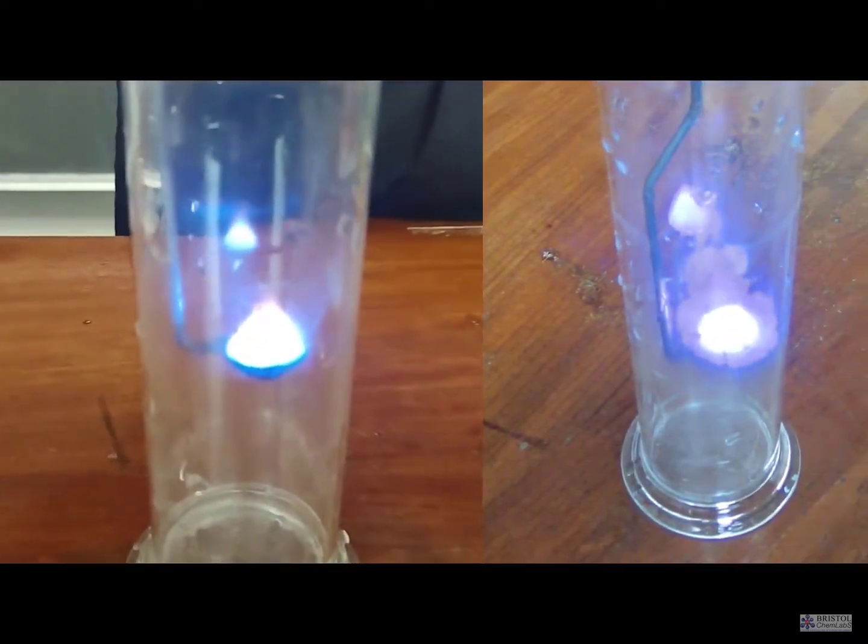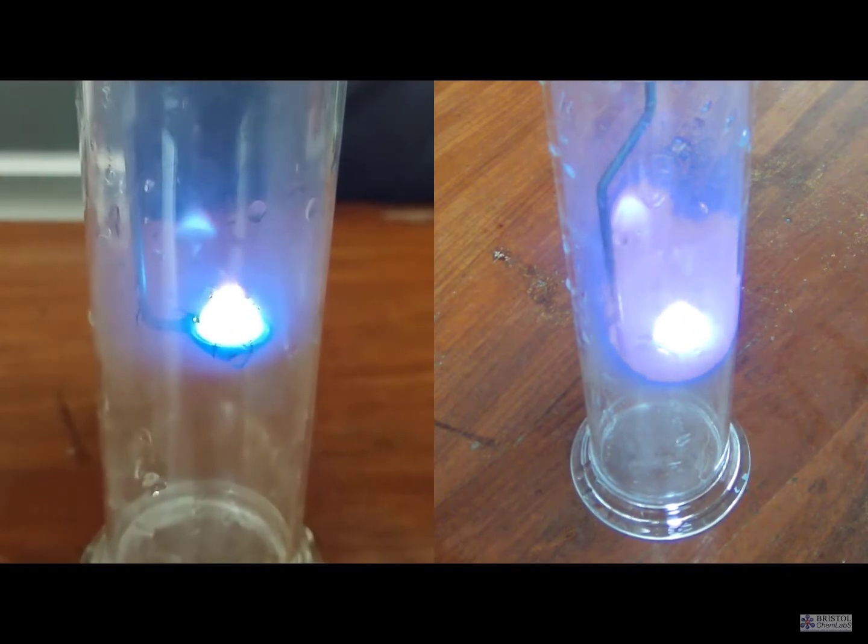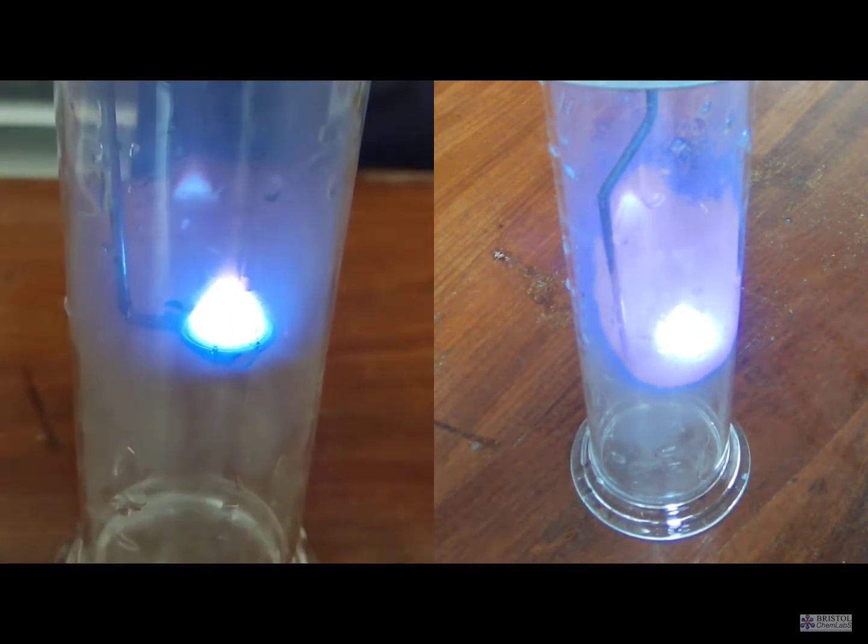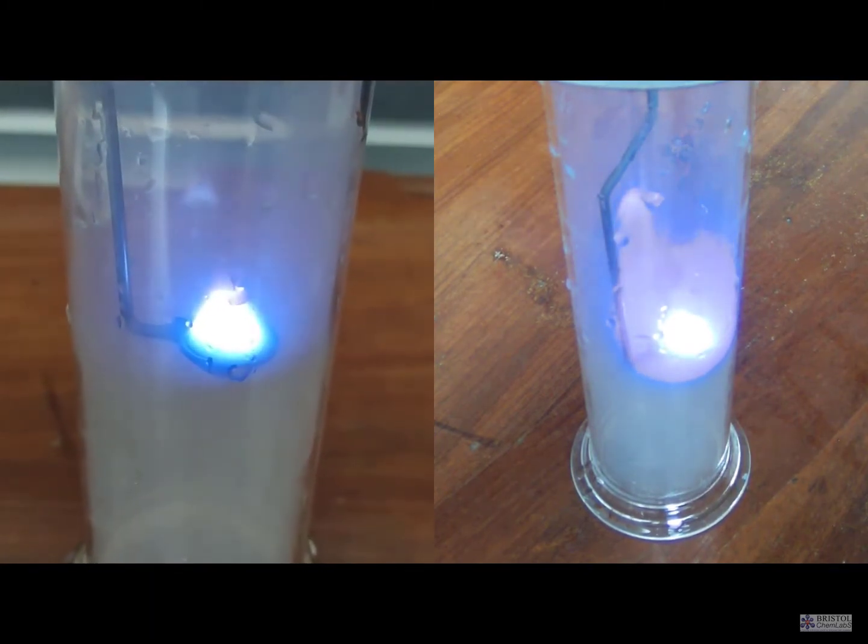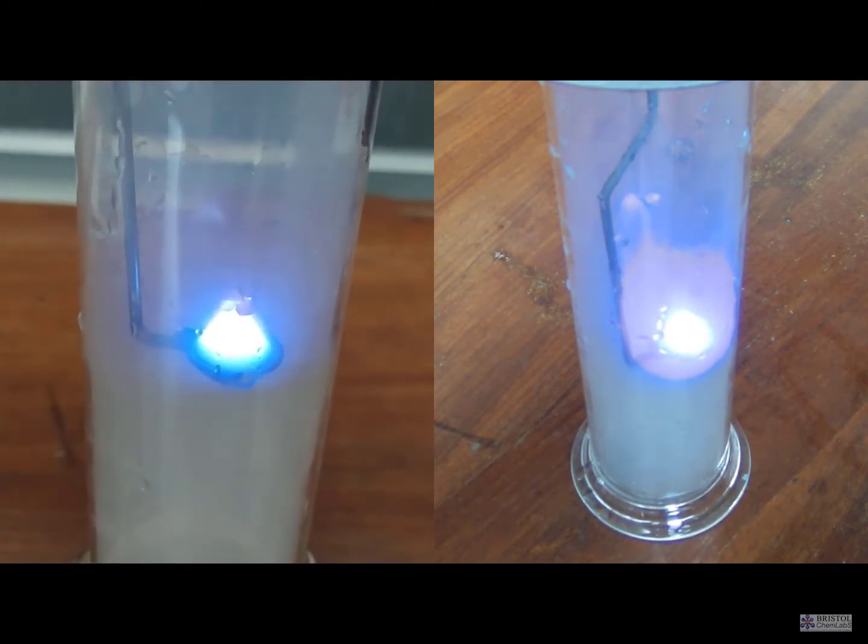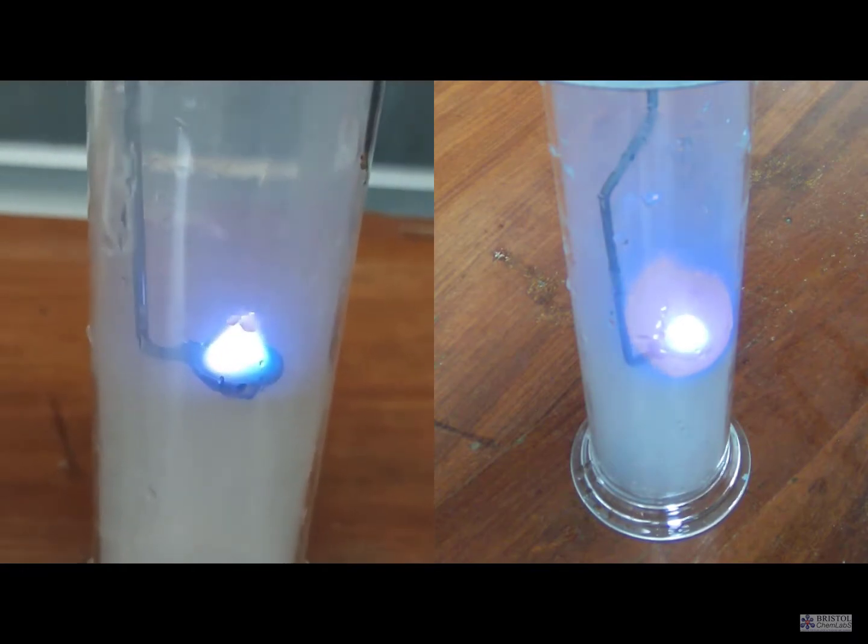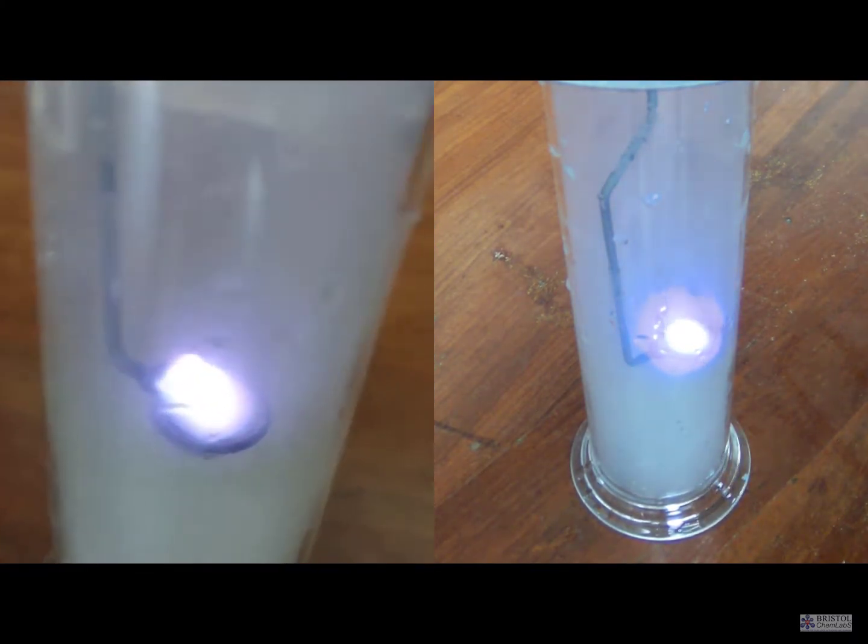Whether you're using sulfur or magnesium, you need to get the reaction started. So you're going to need a Bunsen flame nearby. Get them starting to burn in air and then quickly transfer them into the gas jar.